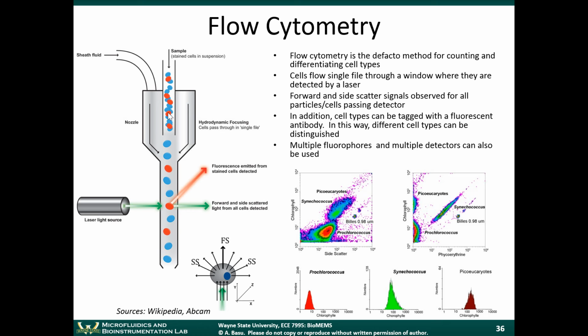Okay. So when these cells are going through the detector, they'll actually give off pulses of light when they pass through. The laser is being held at the same point, but as the cells pass through this detection window, they give off a pulse of light. And those pulses of light can be detected by light detectors which are placed near the detector region.